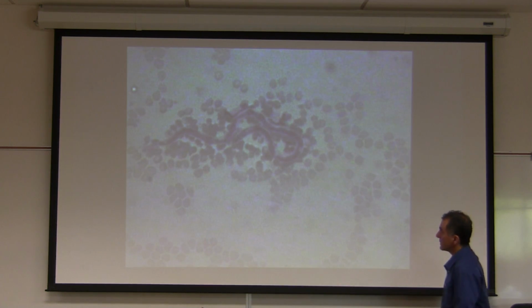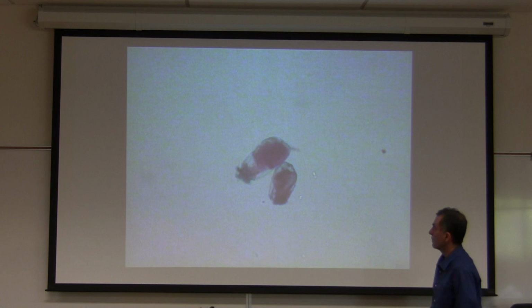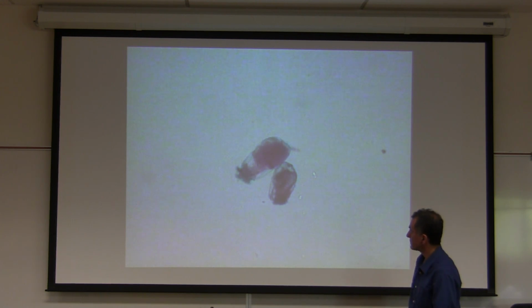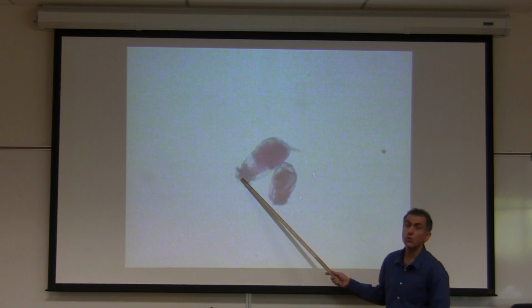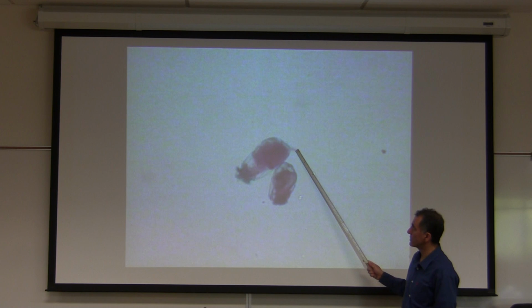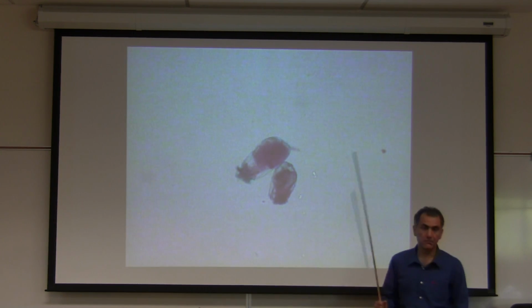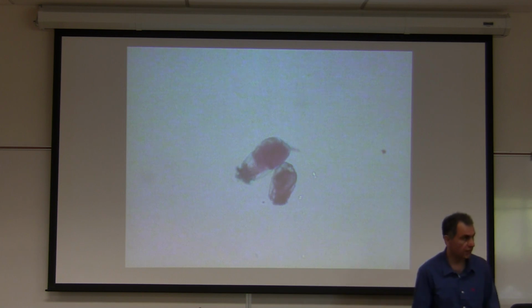What is the common name? Dog heartworm. Okay. What is the name of the organism? Philodina. What is the name of the structure? Corona. What is the name of the structure? Body. What is the name of the structure? Tail, foot. Okay. What phylum? Rotifera. Phylum Rotifera.